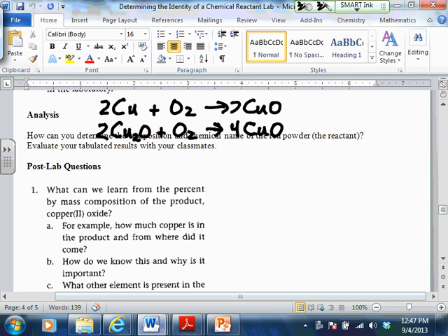Okay. So there's our 2 equations, all right, and they're balanced. This is supposed to be a 2. I don't know what happened there. Oh, I erased it. Either way, we're adding oxygen, so the mass should eventually increase. Okay, so that's not going to help us that much, but the amount the mass increased by, that might help us. Okay, so let's think about this for a second.